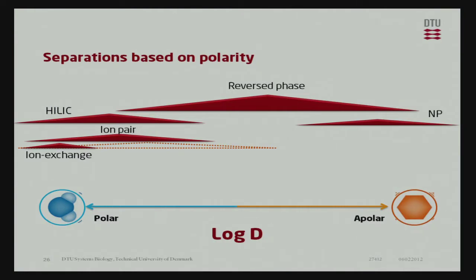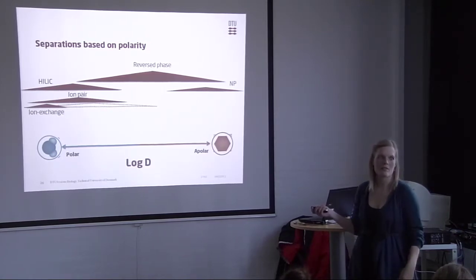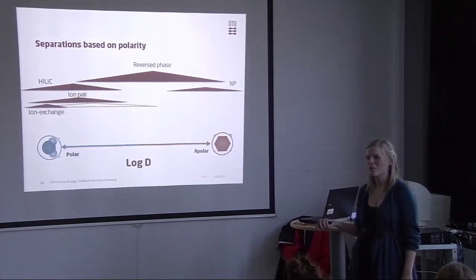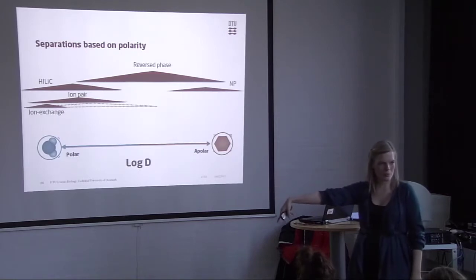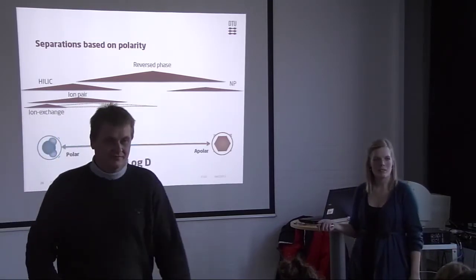And the point is that it's fairly easy, as soon as you know the principles, to put in the compounds in the extremes. So recognize the really polar compounds and the really apolar compounds. And all the things in the middle can actually be quite difficult to predict. I talk to some of you and you say, oh, you can't see the difference. How on earth do you see the difference? You don't. And this is exactly why we got more than one separation principle, because sometimes it's not easy to predict. So if we can exploit a charge or a size instead, that might be more optimal.